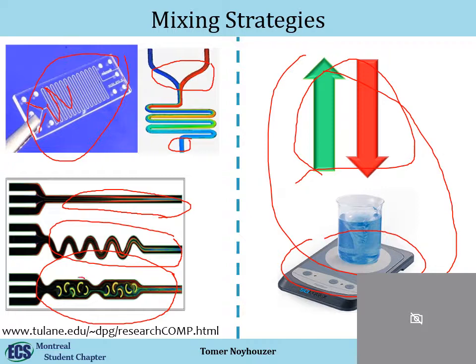So you have this turbulence behavior, not laminar anymore. And then when you decrease it, you have high pressure and low pressure. And she did a series of those, and she saw that at the end, you can also have an almost well mix. So you can also tweak that, and in this case, you can see she has three inlets. So she tried to mix three different liquids and measure the efficiency of that mixing strategy.